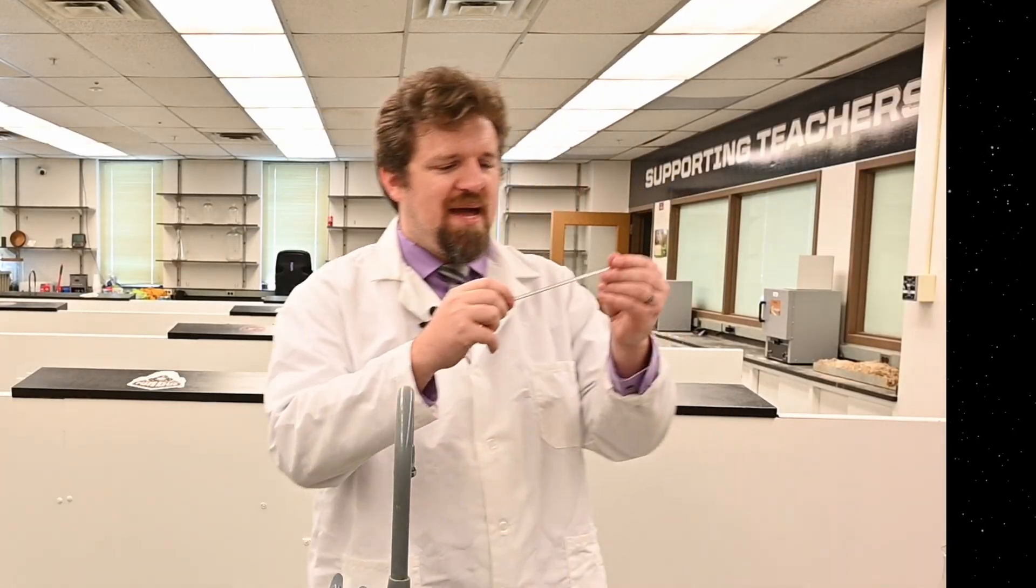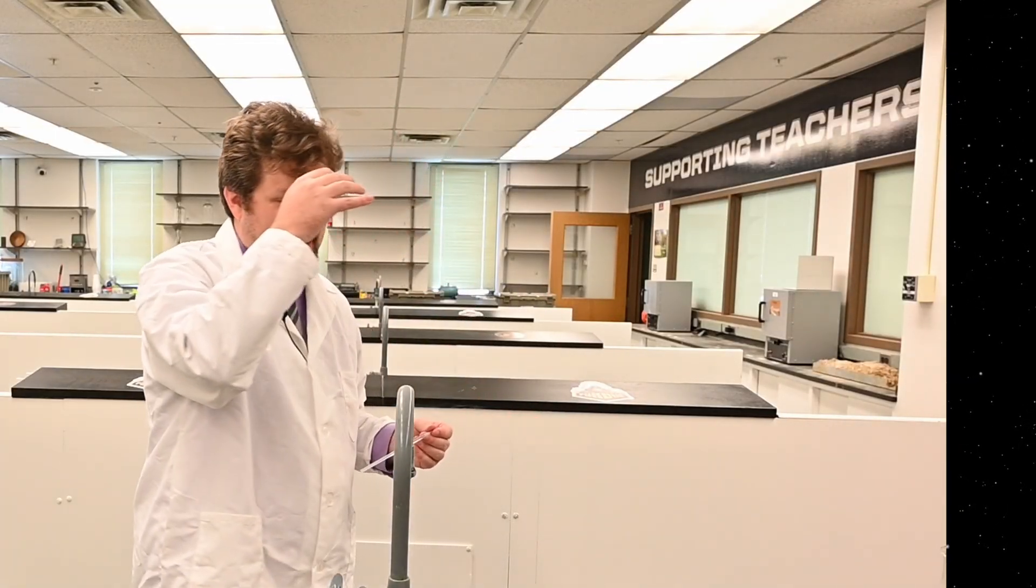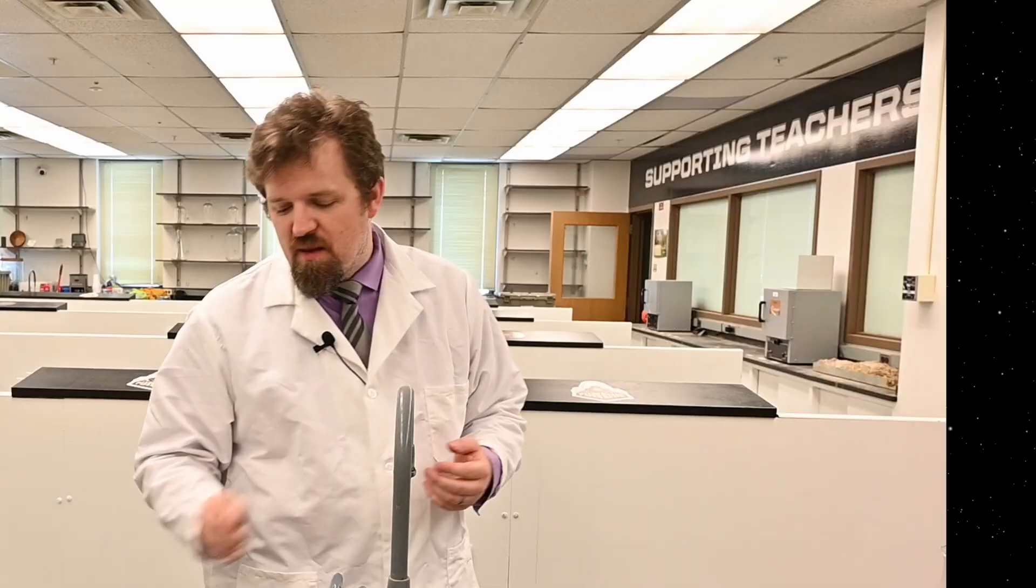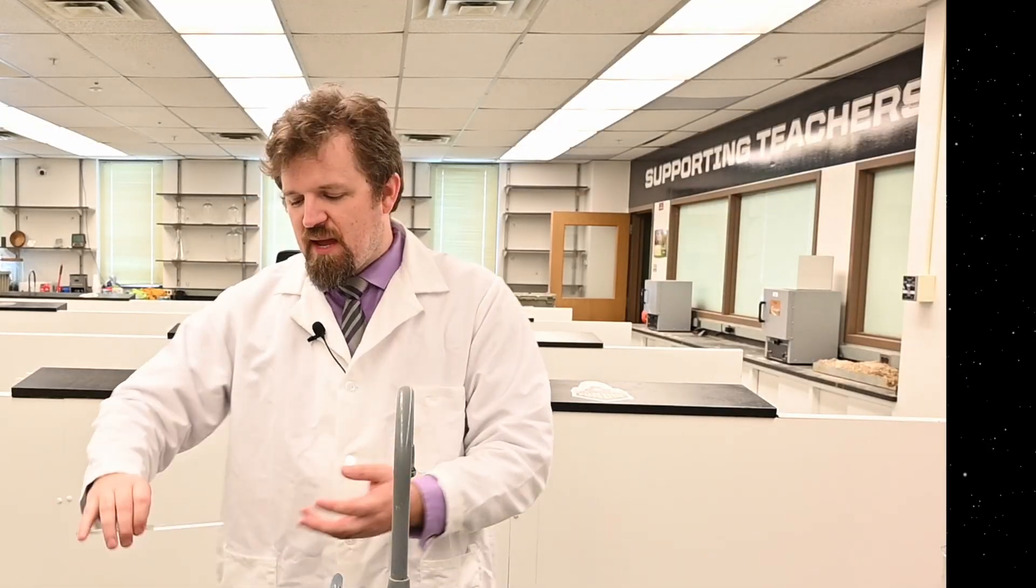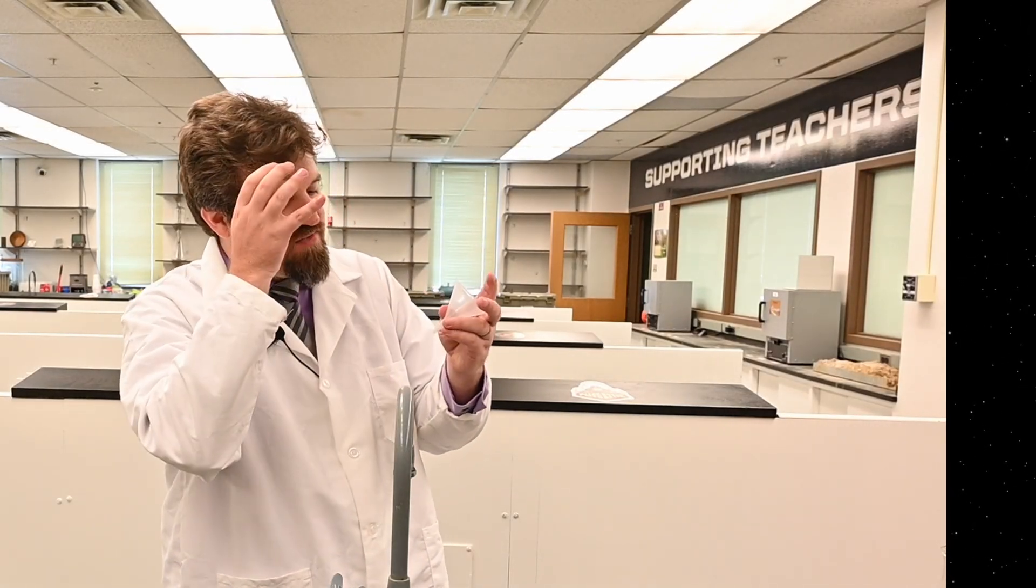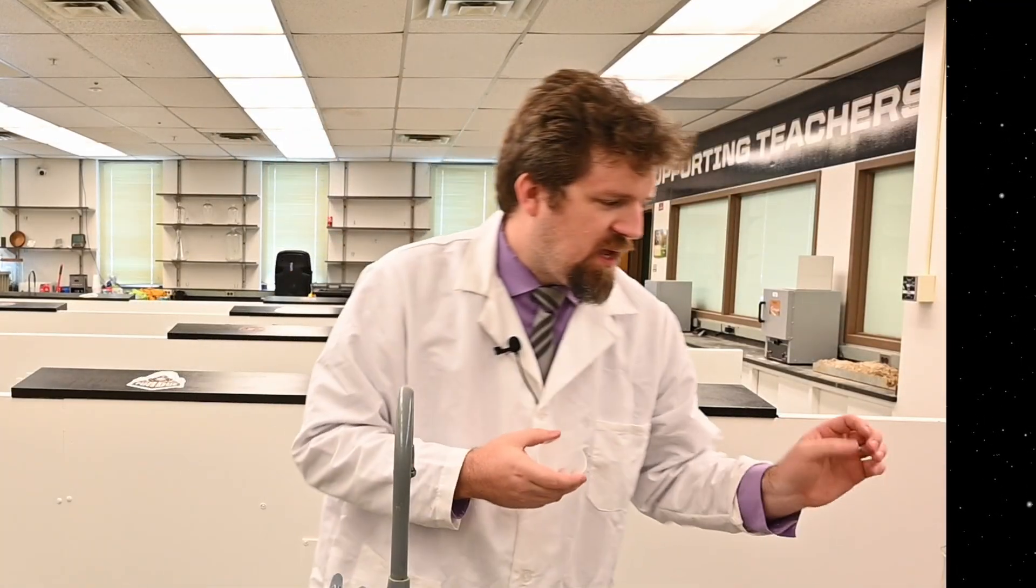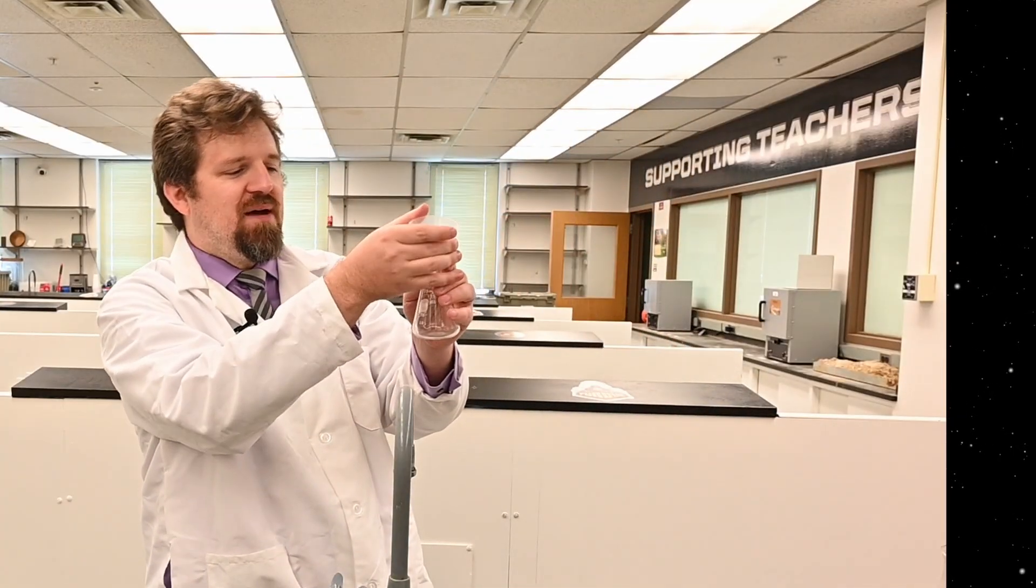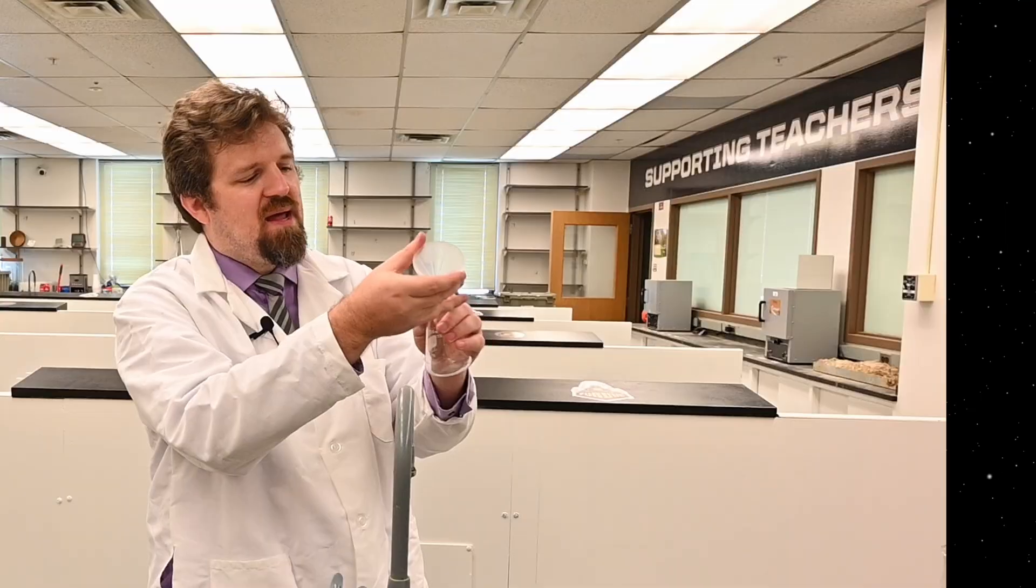Like I said before, this is called the glass stir rod. Just be careful with them when you set them on the table. One of my favorite sayings in chemistry when it comes to lab work is, round things roll. I don't know how many of these my students have placed on the table and then it just rolls off. And when that thing hits the ground, it shatters into a million pieces. And then lastly, I have here something you'll probably know what it is, is a funnel. This is a plastic funnel, but you have glass funnels. Be careful with the glass funnels, especially the long necks, because they're just very fragile. If you put it down into a flask and you start bending left and right, you can put the wrong kind of torque on that and you can actually snap off the necks.